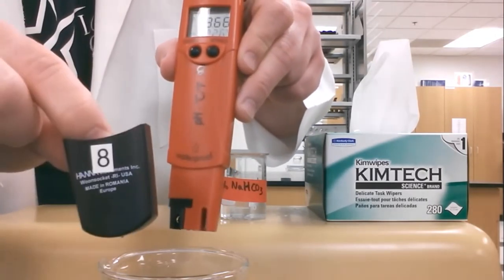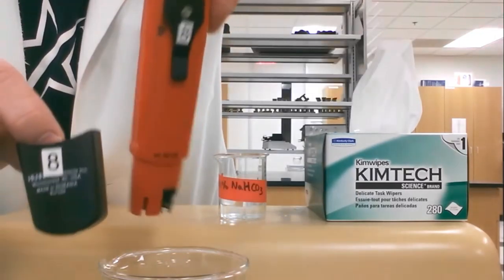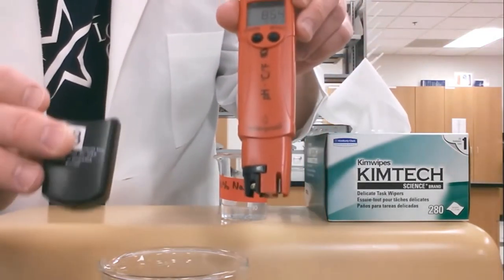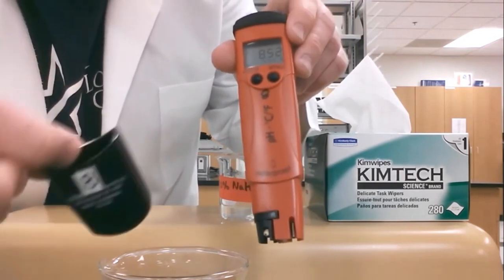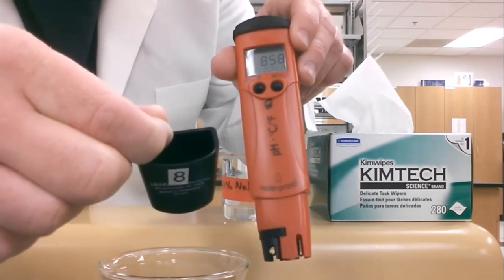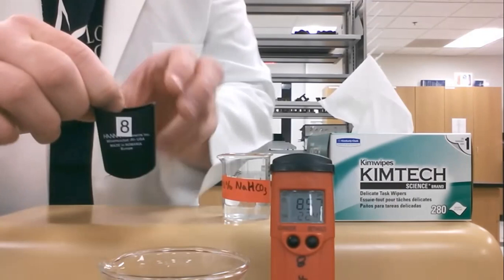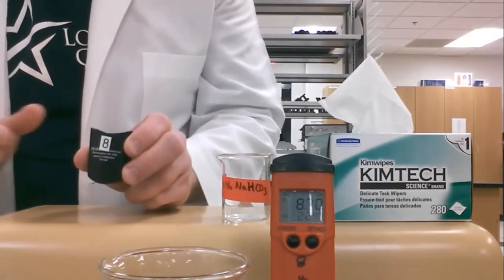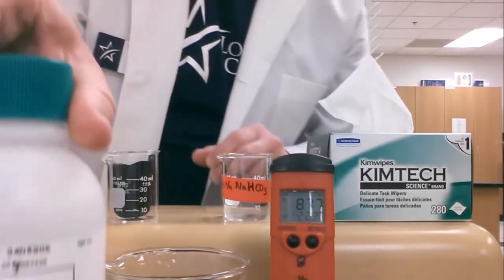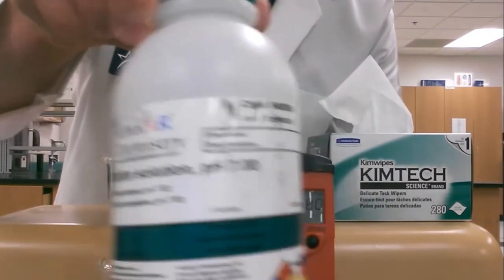Here I have the caps numbered, so if you see this cap is number 8, this pH meter is also number 8. When you're ready to put this back on, you're going to have to make sure that there's a buffer solution inside that cap in case we spilled any out when we were taking it off. That happens very easily. So what we're going to do is set our pH meter to the side, and we're going to take some pH 7 buffer. That's this right here. It's a pH 7 buffer solution.